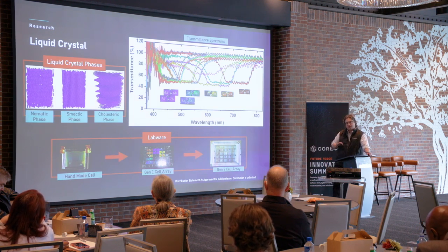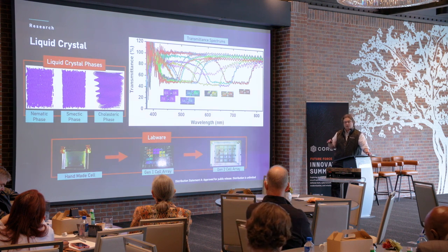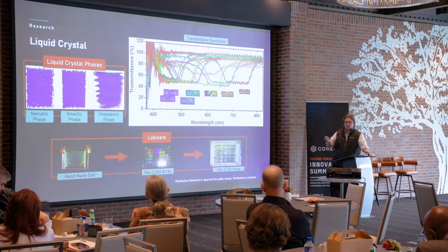And lastly, we have originally worked on these liquid crystal designs. Here we had to redesign our substrates from the ground up. On the far left here is our handmade cells that we typically use for our research when a human is doing it. So that's 2 ITO-coated glass slides with an LC material sandwiched between them. You're able to apply electric potential to the glass slide and get a physical response from the LC material.